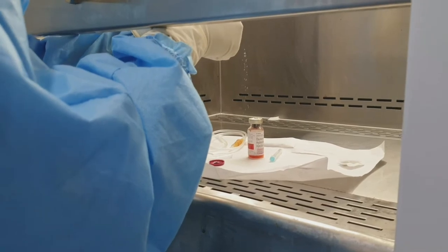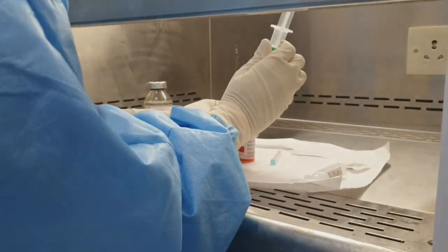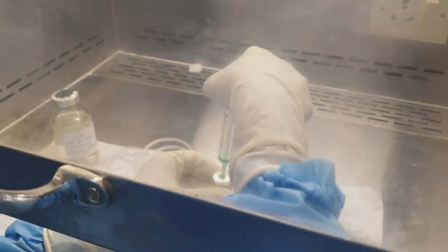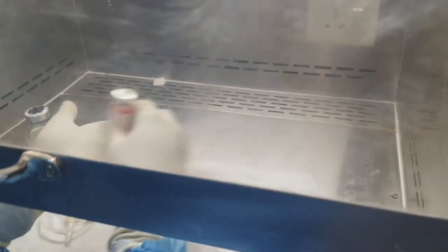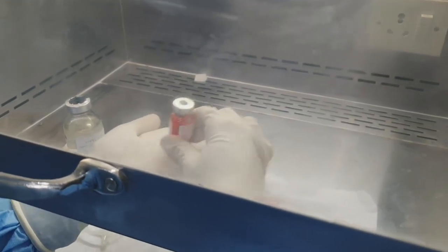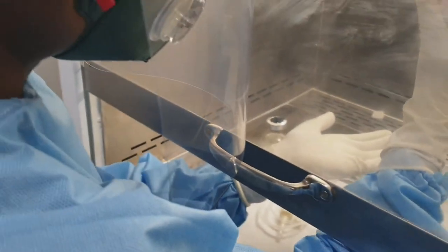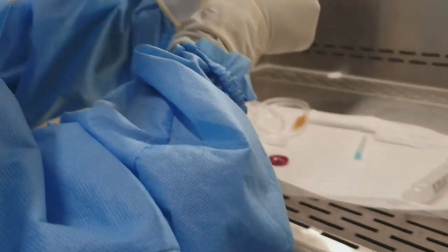Daunorubicin has to be diluted with 10 ml of sterile water. 10 ml of sterile water is inserted in. Never vigorously shake the chemotherapeutic agents, but gently rub on your palm to dilute the mixture. Look for any visible particles — if visible particles are there, continue to rub on the palm. If there are no visible particles, then you can collect the solution.